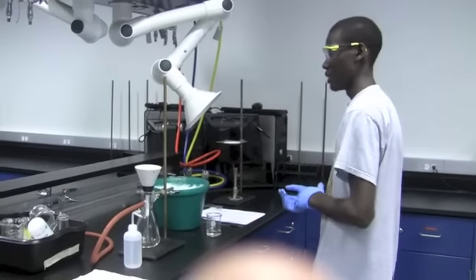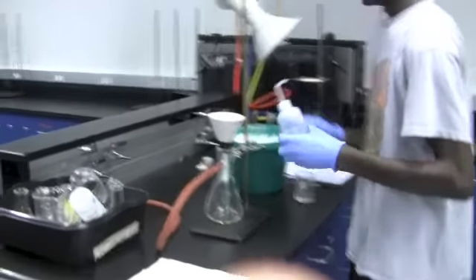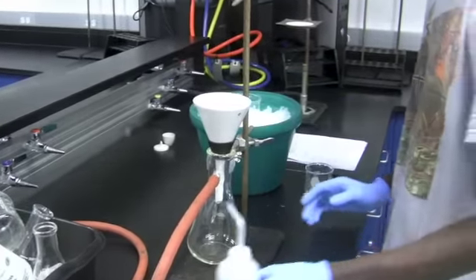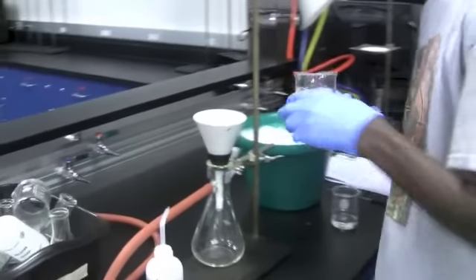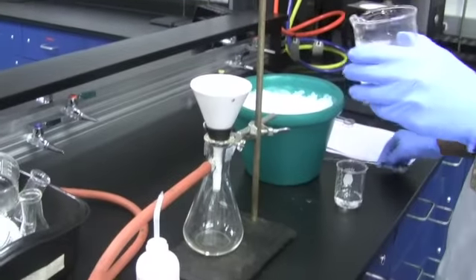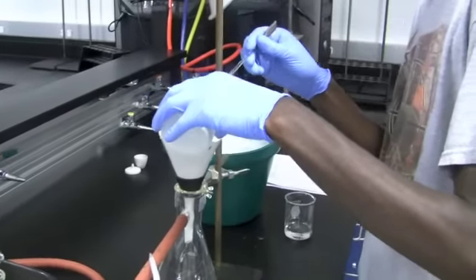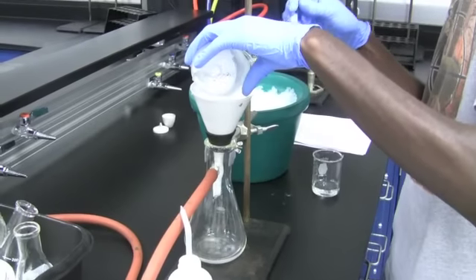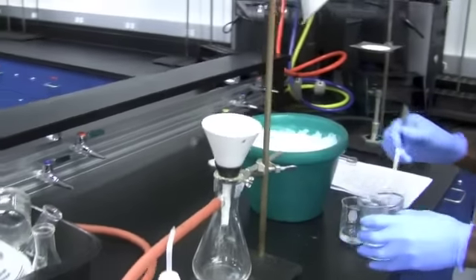Now the next step in the experiment is filtration. Before we filter, once again, take your distilled water and be sure to wet the filter paper. After doing so, we're now going to take our crystals which are formed and begin to filter it. If needed, use a glass rod to get all the crystals out. Now we're just going to wait for it to filter.